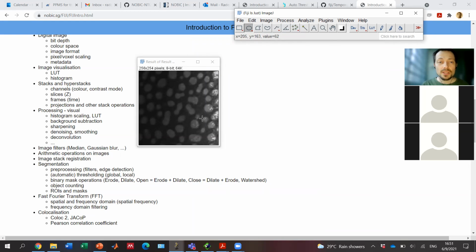Let's go back and look at another way I can segment this type of image, which takes into account the surroundings of each pixel, and in an even more sophisticated way than the local threshold. The local threshold was doing some sort of sliding window, where it looked at each part of the image and did the thresholding algorithm not on the whole image, but only for a part of the image.